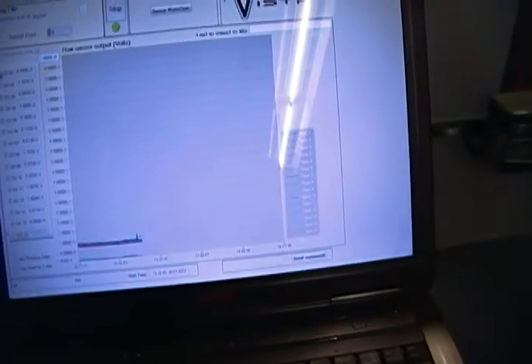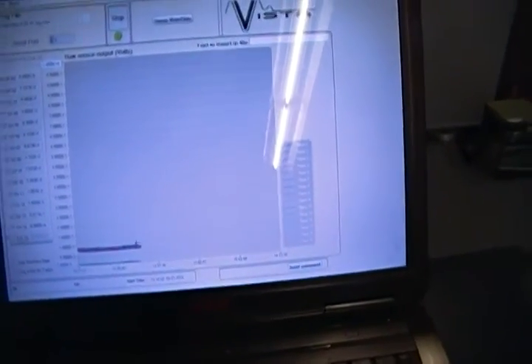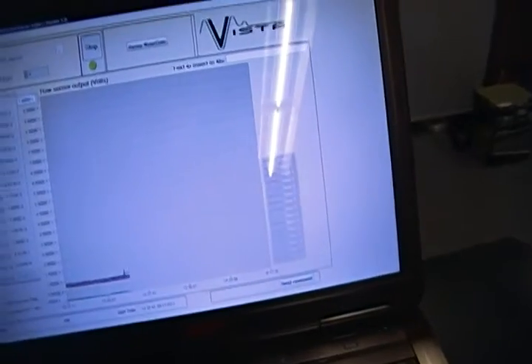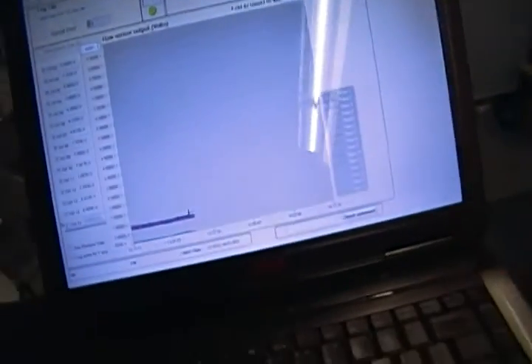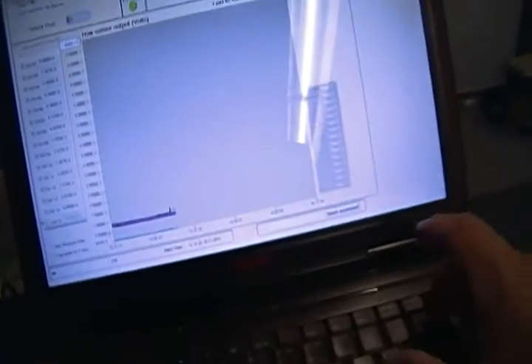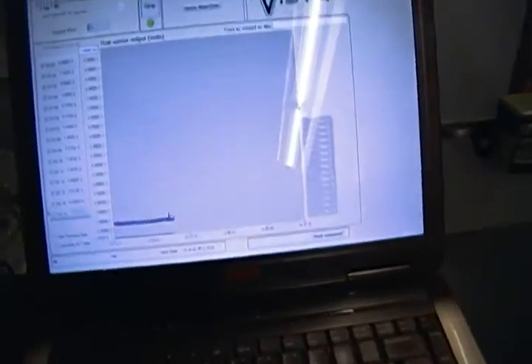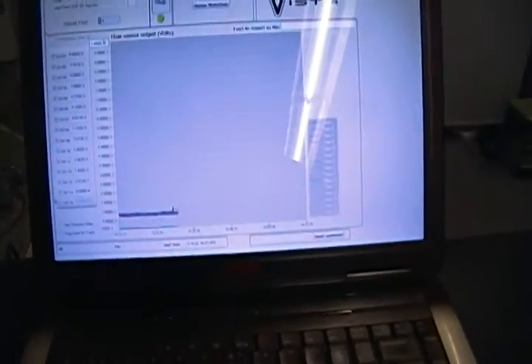No. In fact, what I ended up doing is changing the scale there, which is not what I wanted to do. Well, let me play with this a little bit. I changed the scale inadvertently, but you can see how well it was working. I'll come back shortly.